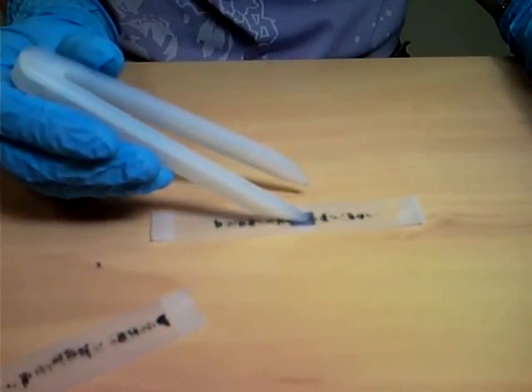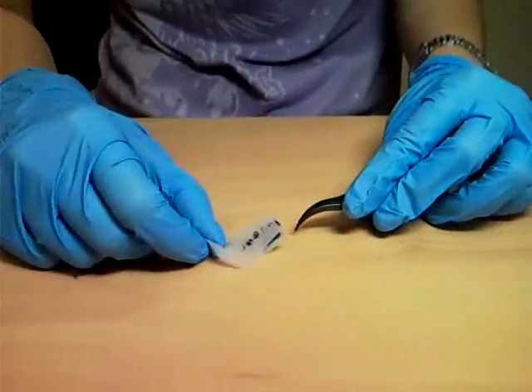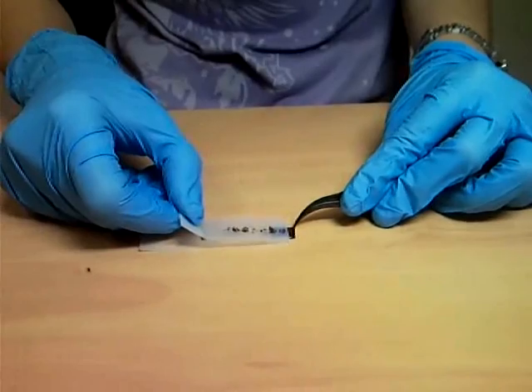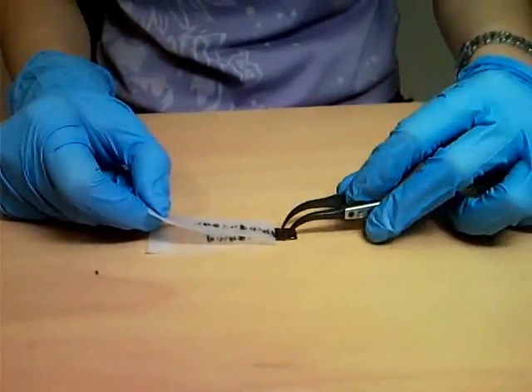Use plastic tweezers and gently rub the area of the scotch tape where graphene may potentially be. Slowly peel off the scotch tape so as not to break any potential graphene sheets.